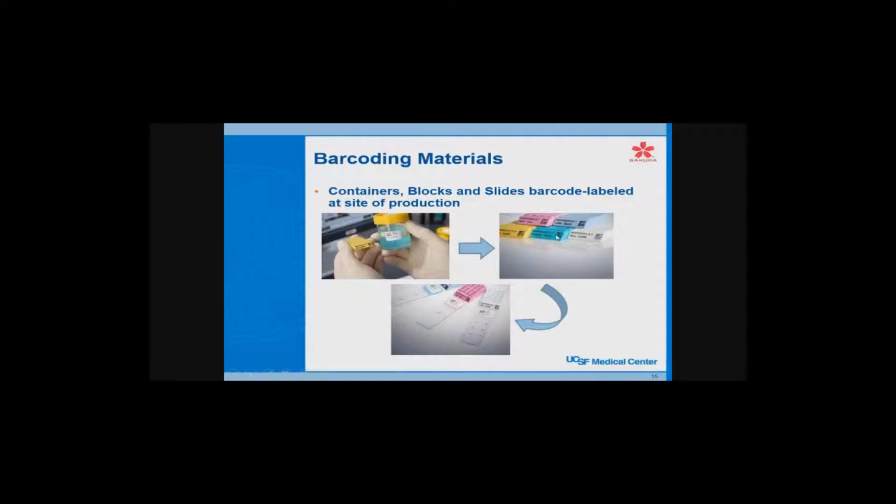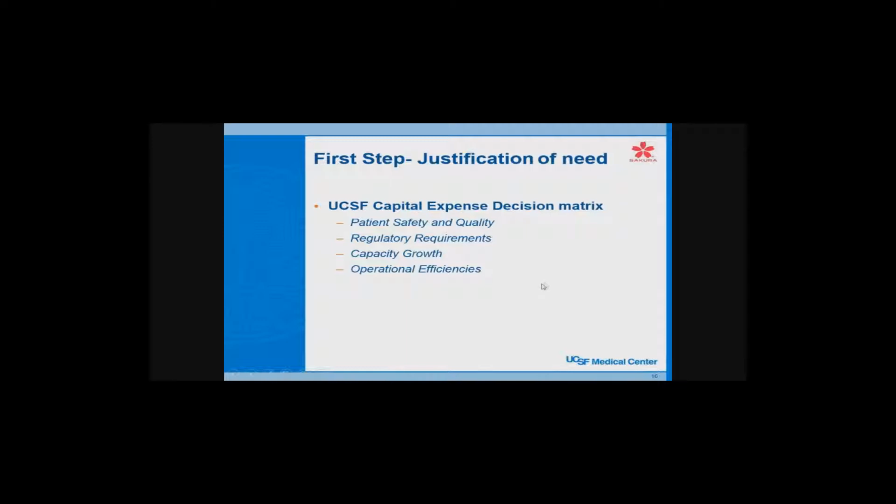This slide shows the ideal of what we're working towards. You have a container that has a barcode label, or we call it a barcode. It's actually a 2D code. Barcode is the nomenclature that everybody likes to use. It's a little bit easier.